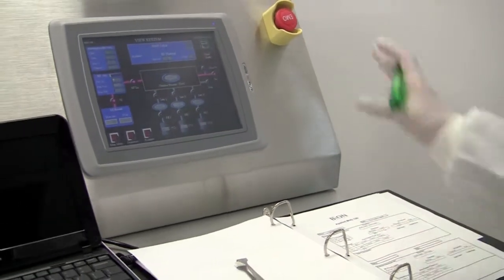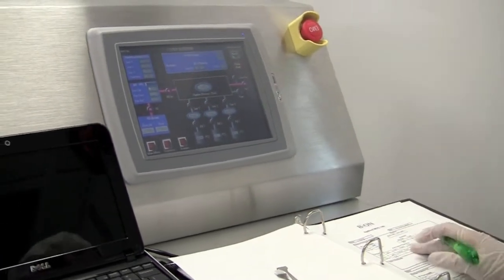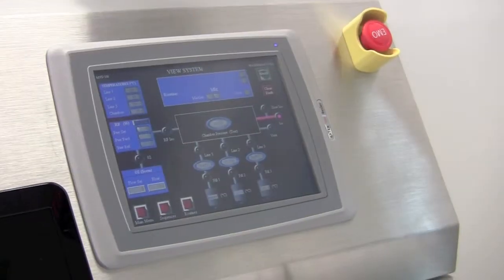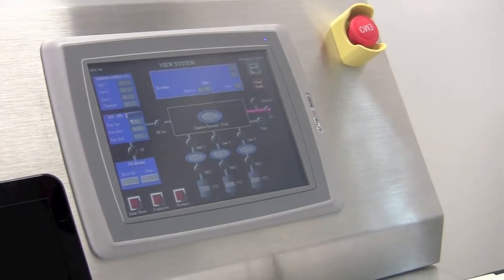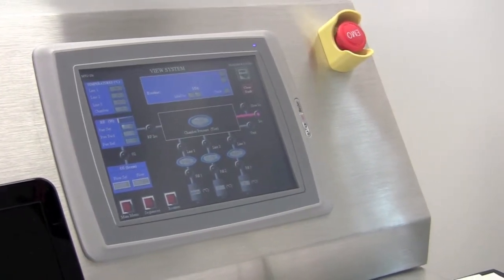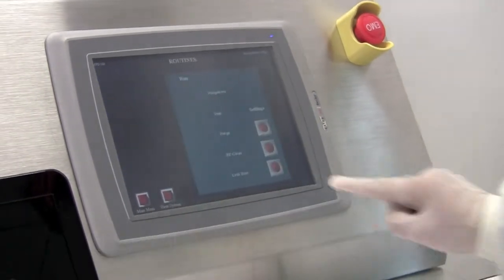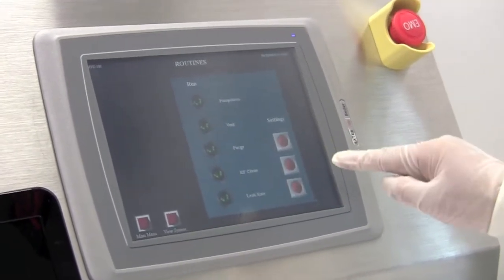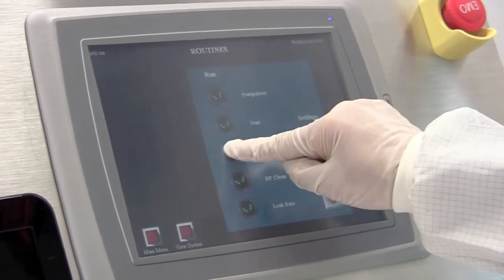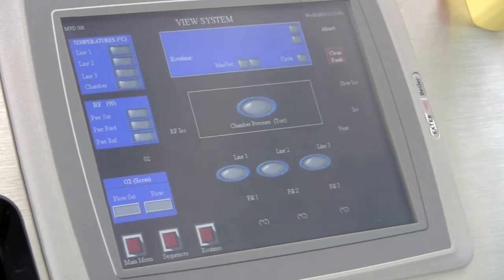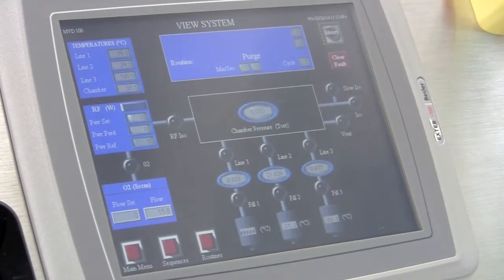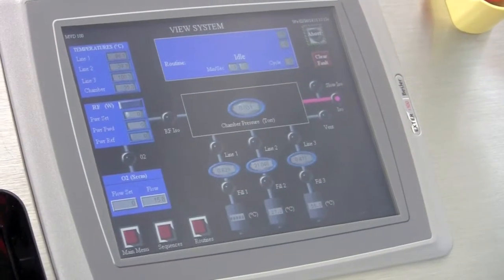So after four hours, we come back to unload the sample. Now after four hours, the process is done. The system is at idle mode. So we can unload the sample by touching the routines button. Same thing, touch purge first. It will take about one to two minutes. Now the purge step is done.